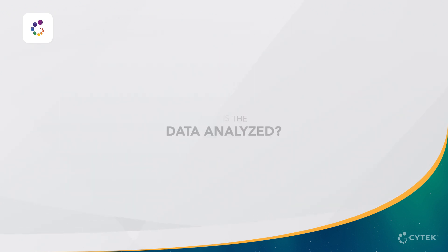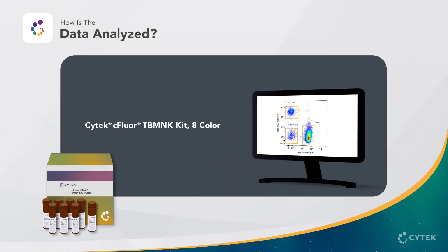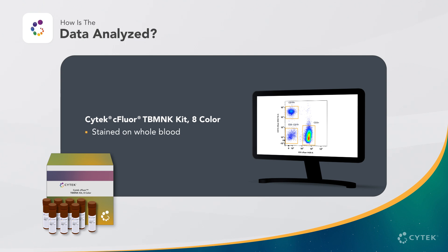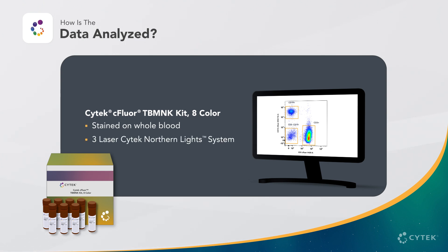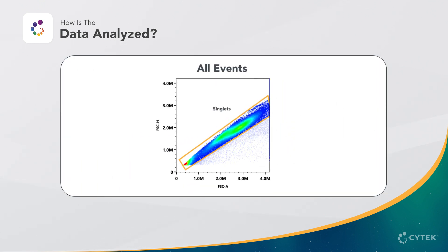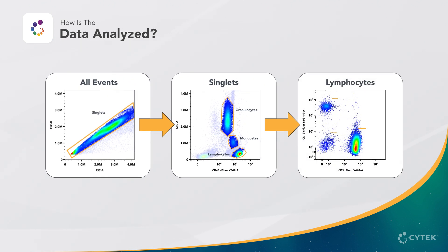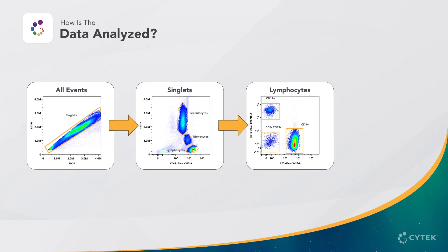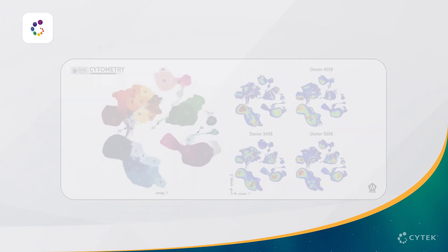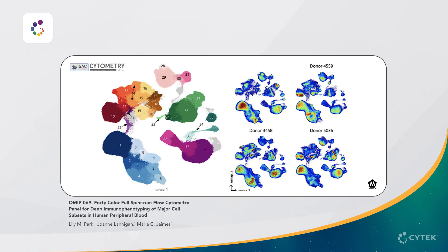How is data analyzed? Once the data is recorded, it is typically analyzed using an analysis software. Here we show data from Cytec's C-Floor TB-MNK kit, stained on whole blood and acquired using a 3-laser Northern Lights system. We first identify single cells using forward scatter, then can differentiate granulocytes, monocytes, and lymphocytes using side scatter and CD45. We can further investigate by drawing a gate and displaying the gated cells to examine markers of interest, such as using CD19 and CD3 to differentiate B cells and T cells, and the CD8 versus CD4 T cell subsets. For higher parameter datasets, unsupervised data visualization methods can be used to identify cell subsets with similar expression patterns.